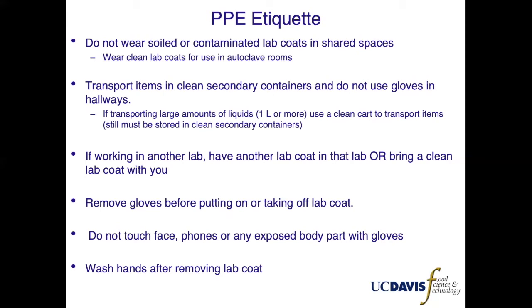If you're working in another lab, have another lab coat in that lab or bring a clean lab coat with you. This is especially important for those who are working with biohazardous materials. Different labs may have different hazards, and you don't want to contaminate any lab with hazards you're working with in a different lab. Remove gloves before putting on or taking off lab coats. I've seen people touch biohazardous materials or chemicals with gloves, remember that they need to wear a lab coat, then put that lab coat on wearing those same gloves.